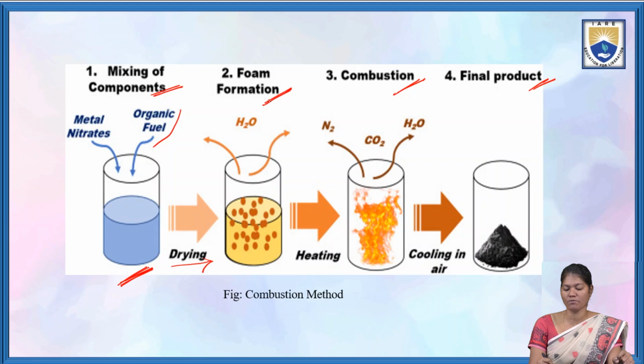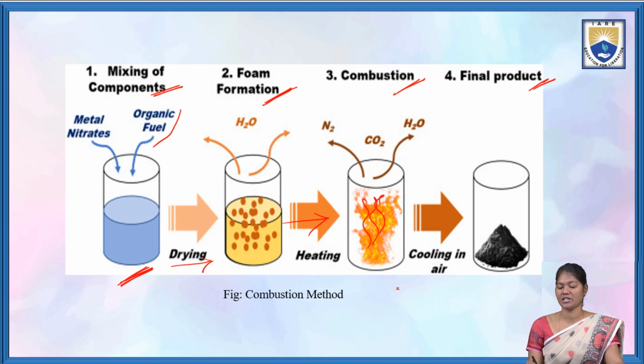Some foam formation will happen. When heating this solution, flames will come out at a particular ignition temperature. That means combustion starts. After the combustion, what happens after cooling? There will be a fine powder of particles which gives the nanoparticles. So this is the final product, the nanoparticles.